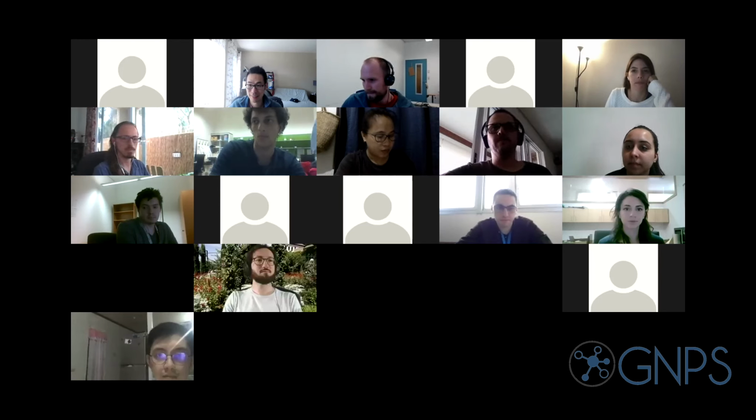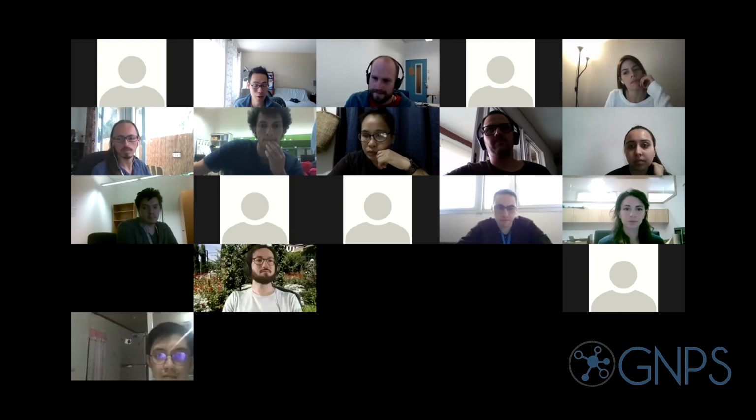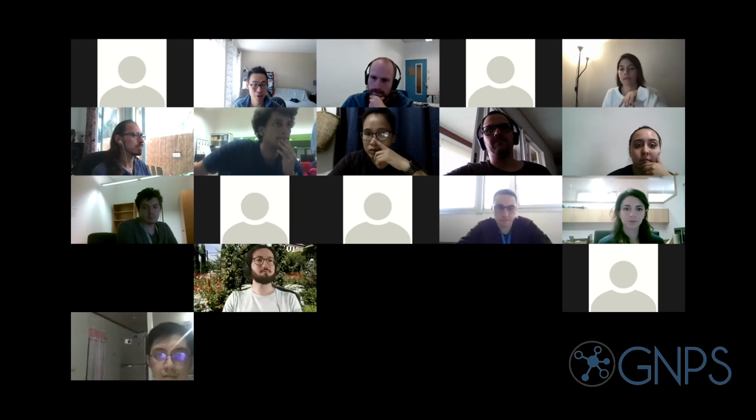Awesome. Well, if you do find bugs or if you like it, we would love to hear from you. And if you're going to use it in a class, just give us a heads up, just in case we do maintenance at any particular times. But yeah, if you want to do it in a class, feel free to do that. We've done it at UCSD a couple times, at Point Loma, at Arizona. So it seems to work out, and hopefully it helps. At least you don't have to install any software. So I think that's at least a bare minimum of a win.